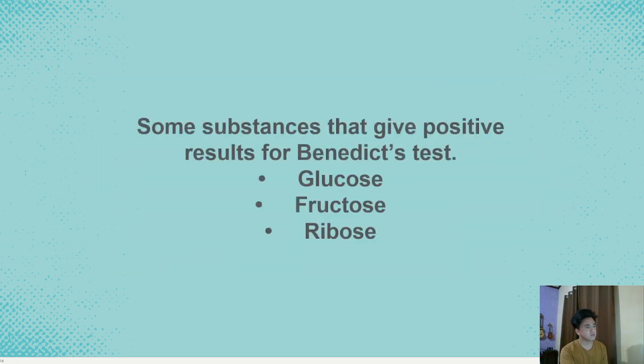So, these are some substances that give positive results from Benedict's test. Some examples of substances that yield positive results for Benedict's test are listed below. First we have glucose, second fructose, and third ribose.